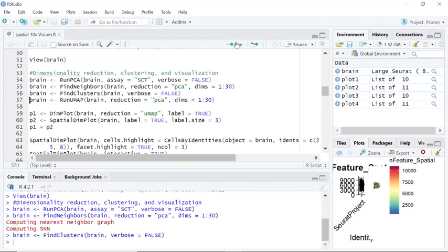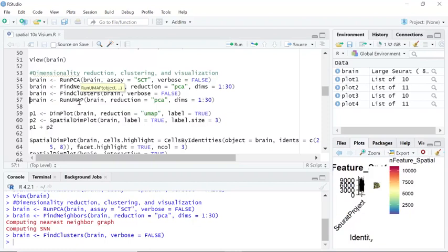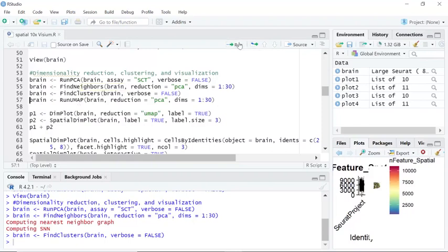Finally, we can use the non-linear dimensional reduction technique UMAP to project the similar spots together in a low dimensional space. We can run UMAP.